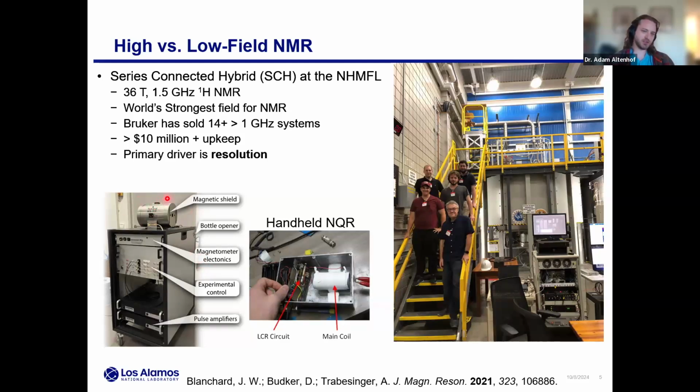With such low fields, you can have untrained staff getting close to this instrument. The wrenches are not going to fly off their tool belt. And a more extreme example, where we're ultimately interested, is this sort of NQR device. This is from my advisor, Michael Malone. You can see he has the main detection coil, his tuned circuit, all in a small RF enclosure. Again, just plug this into an amp and a power supply and away you go.